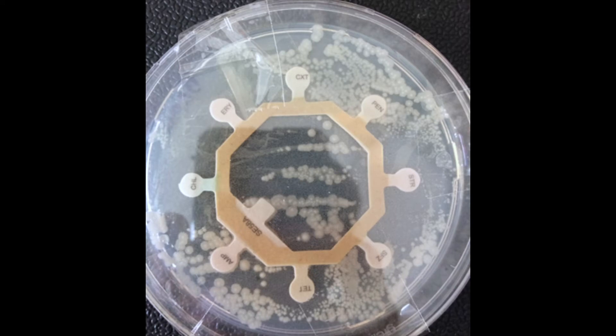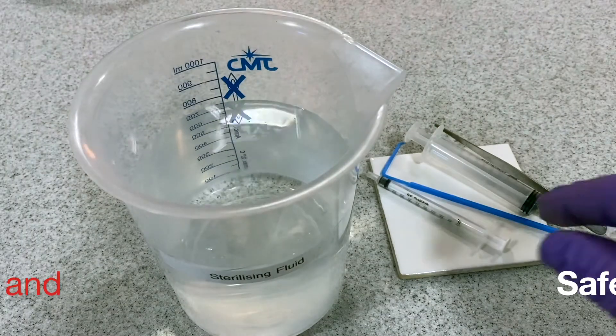Here is an example of a lawn plate showing the zones of inhibition around each antibiotic sample.